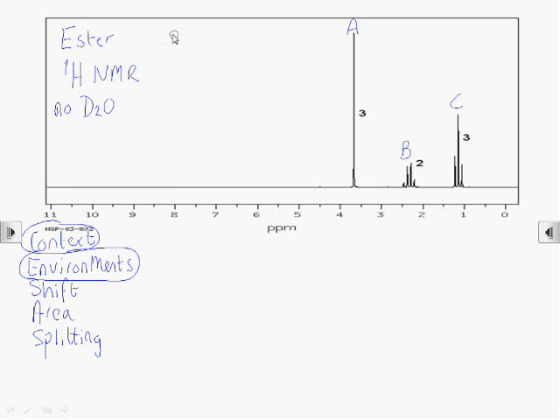Environments, then. There are three proton environments, and I've labeled them A, B and C.